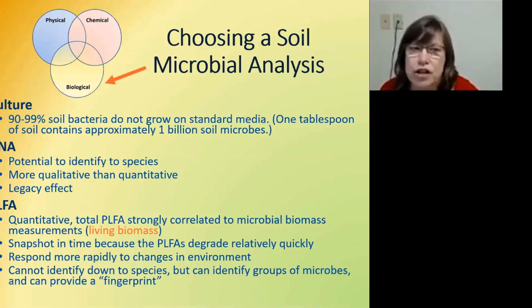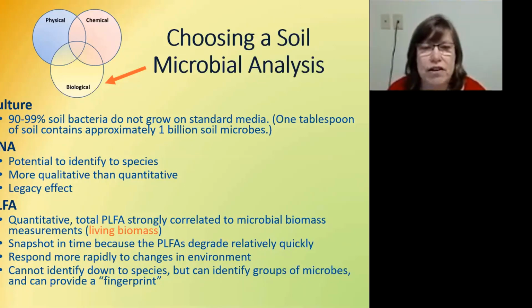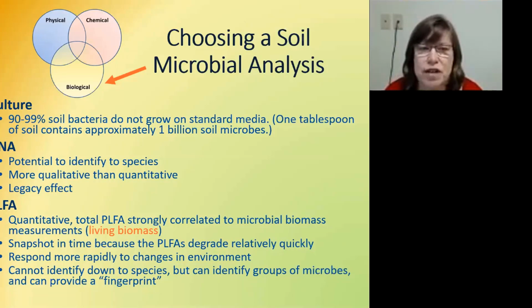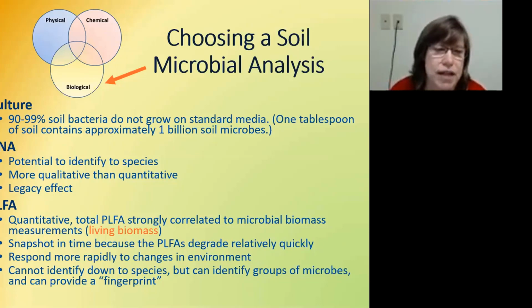So there were sort of three groups we were looking at. There's some that are culture-based, some that are DNA-based, and then phospholipid fatty acid analysis. So the problem with culture is that a lot of the soil bacteria do not grow on standard media, and one of the culture methods we were looking at, it had a lot of different substrates, and I'm sure it gave a lot of information, but we still felt that this was not going to get a lot of the microbes that were in the soil, so that narrowed it down to DNA and PLFA, and this was 2012.